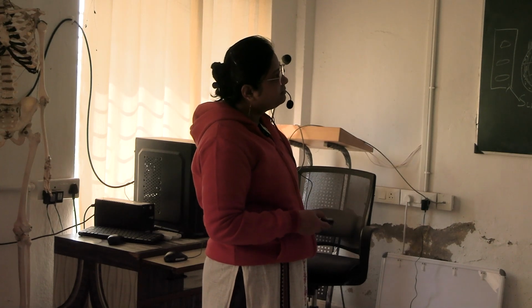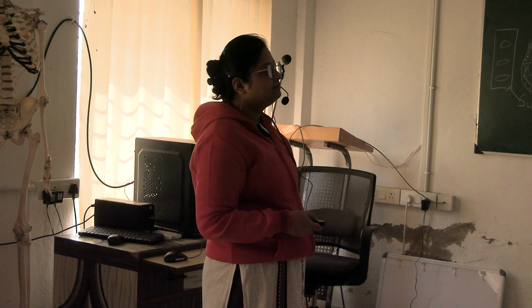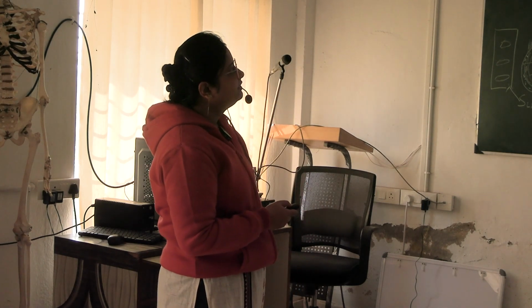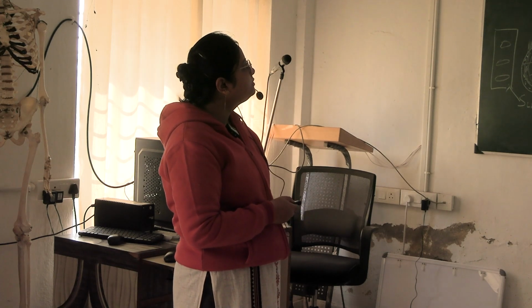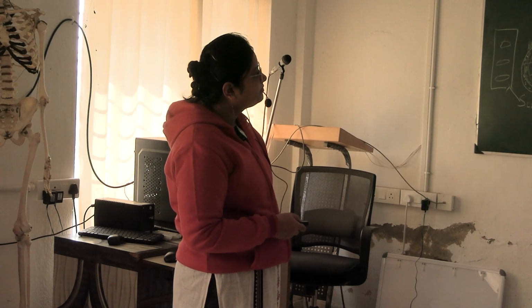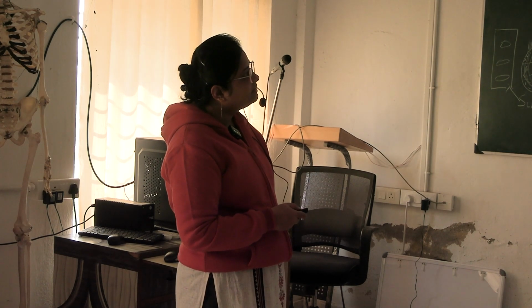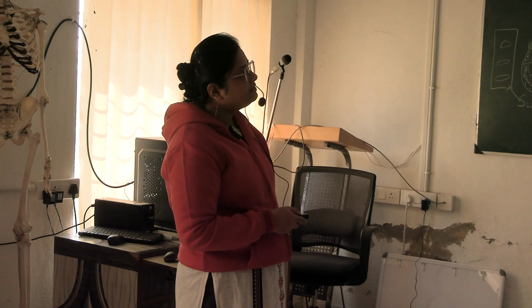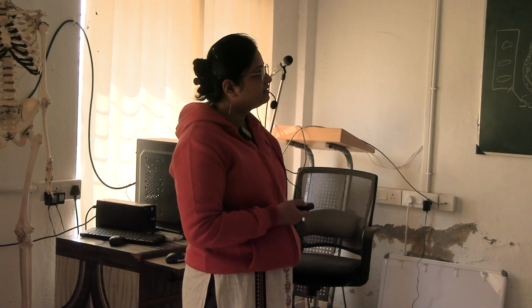These are the sections of alveoli. This is an alveolar duct. It is also connected with the alveoli. No cartilage, no glands. This is an alveolus. You can see the flattened cells. Okay. And here one type 2 pneumocyte, a cuboidal cell, is present. Here also another type 2 pneumocyte has been shown. Here a dust cell has been shown. Macrophages have engulfed the dust particles to form the dust cells.